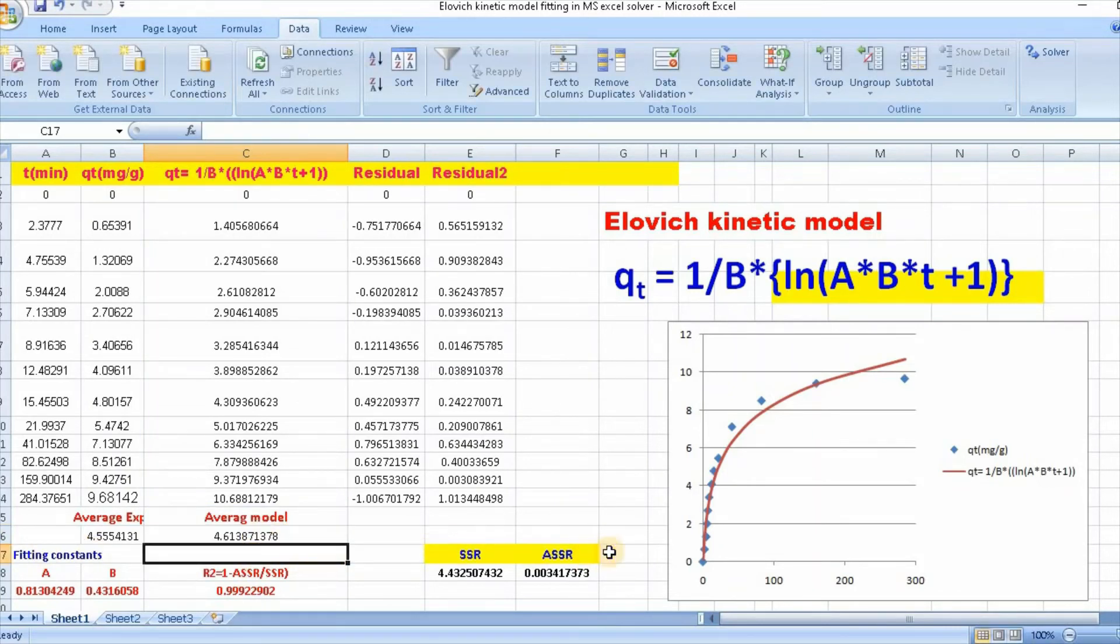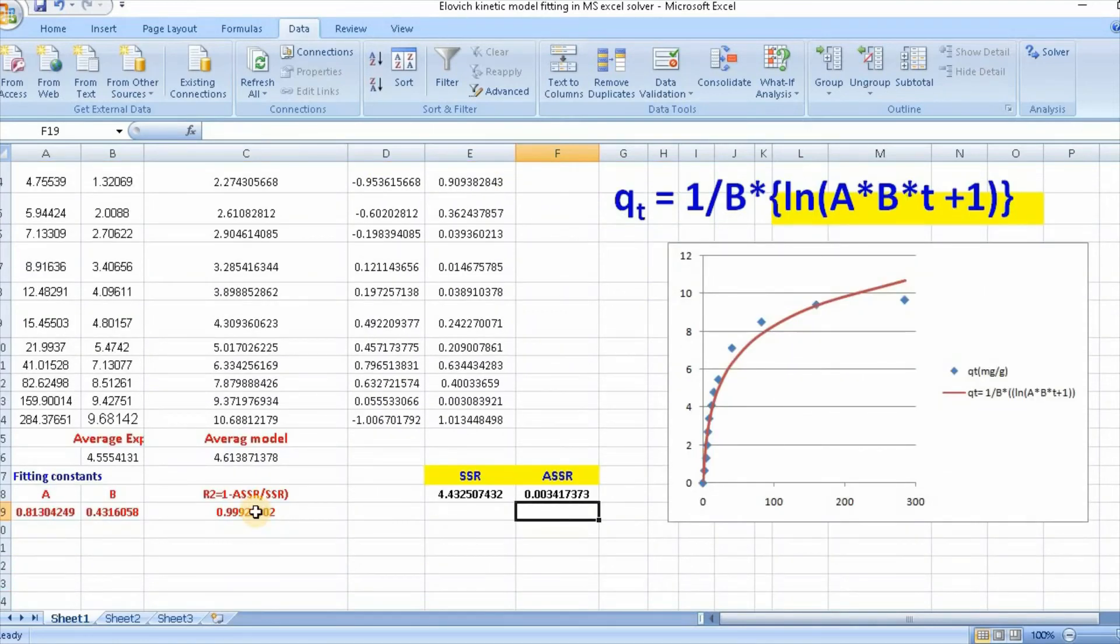You need to calculate average residual sum of square as ASSR, which is equal to just this minus this square, then click enter. R square value equal to 1 minus ASSR divided by SSR, then click enter. Here is our r square value.